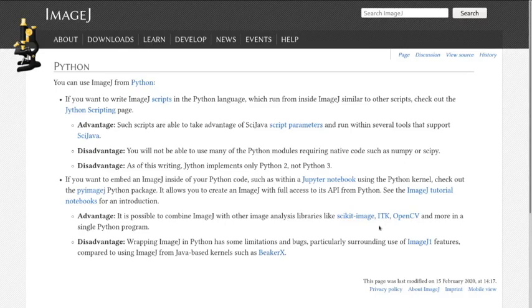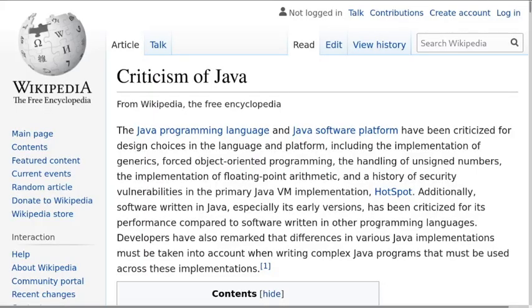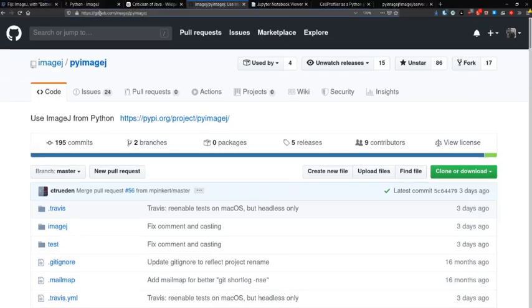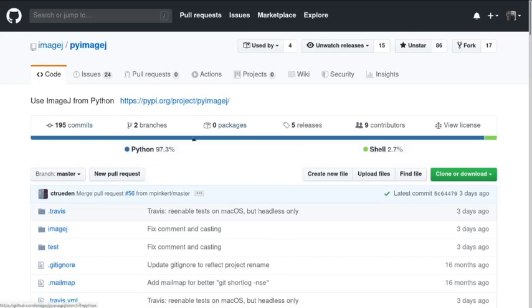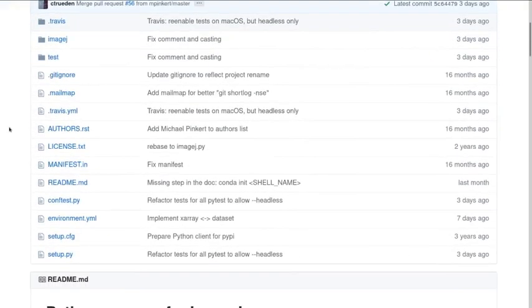So, yeah, I'm going to talk about how this works. The key thing that I'm going to talk about is this package called PyImageJ. And the reason I'm going to do it on webpages is I kind of want to expose you to GitHub a little bit. You've already seen it if you've downloaded the course materials. But GitHub is a fantastic repository that has an awful lot of things Python and non-Python related. This particular one is called PyImageJ. And like our repo, you can see its file structure and then you can see its readme automatically rendered.